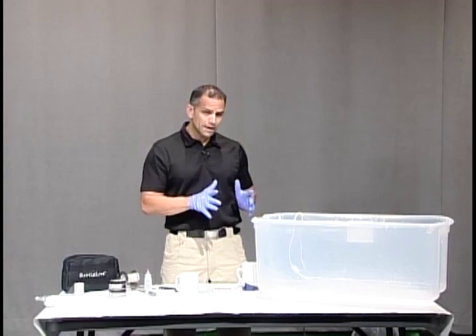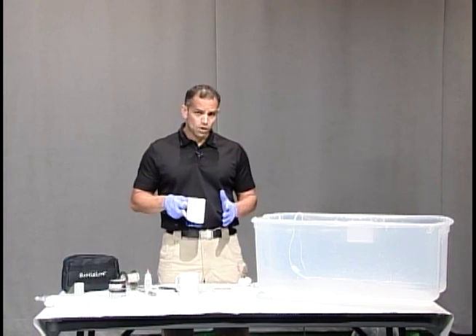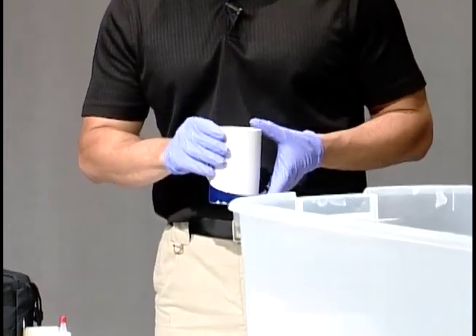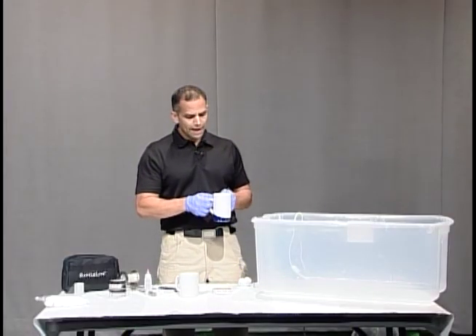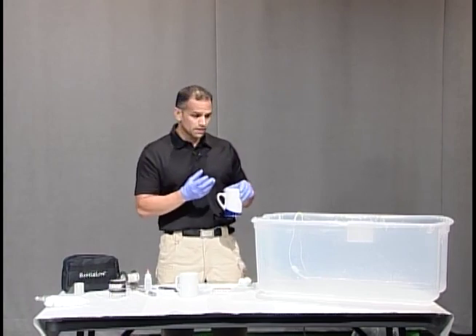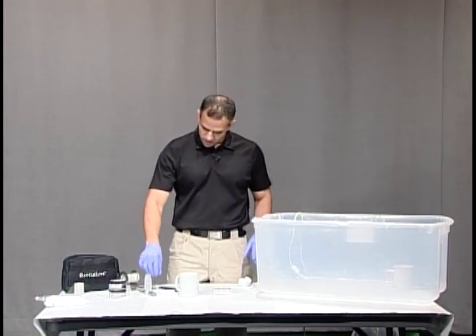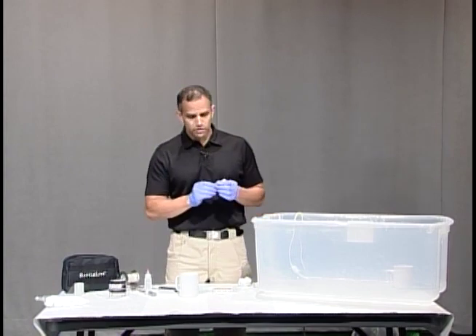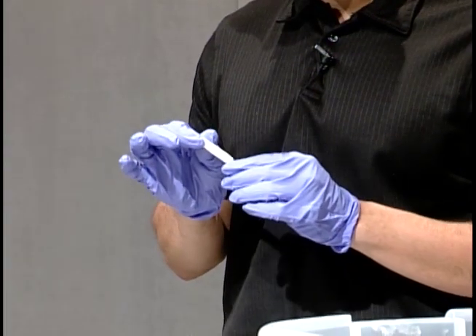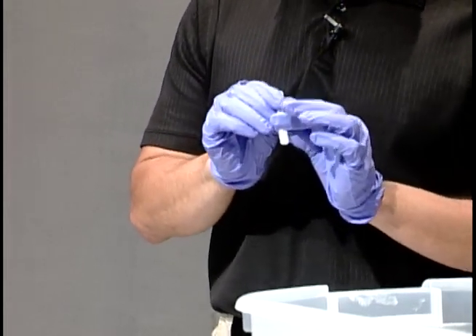Super glue works best when there's high humidity. So what I'm also going to do is take a regular cup of hot water. If you have a water cooler in your office or lab, you could fill that with hot water and put it in there as long as it's steaming. Now we're going to take a regular super glue — any super glue that has cyanoacrylate. You would look at the label, make sure that it says cyanoacrylate, and you can use that super glue.